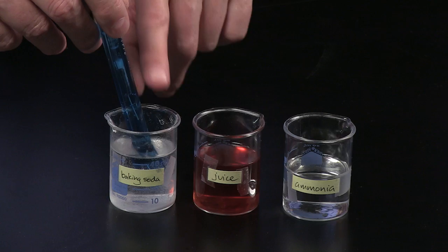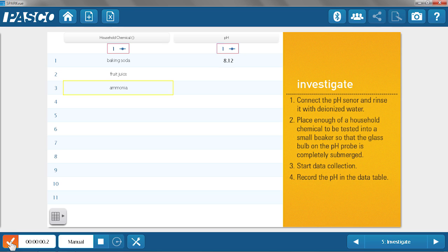Now, since I've never removed it from the baking soda solution, I'm not going to rinse it again. But it's good practice when you go from one solution to another, you should always rinse it. I'm going to hit start. And once my pH stabilizes in that baking soda solution, I'm just going to hit this checkbox because I'm in manual sampling mode.